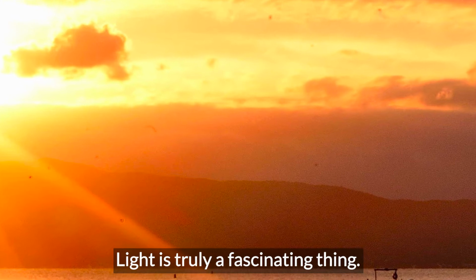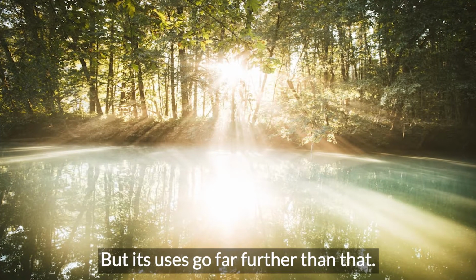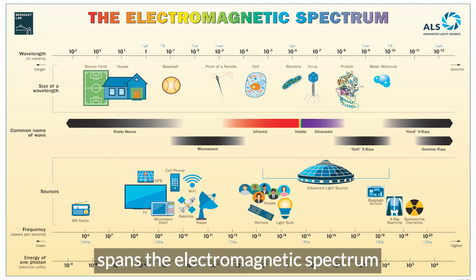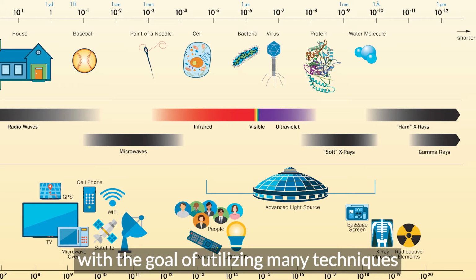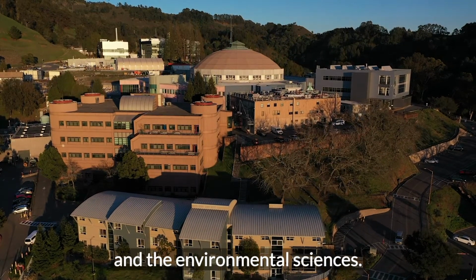Light is truly a fascinating thing. It allows us to see and illuminates the world around us, but its uses go far further than that. The light produced here at Lawrence Berkeley National Labs ALS spans the electromagnetic spectrum from infrared to X-rays, with the goal of utilizing many techniques that harness this light for research in biology, chemistry, physics, and the environmental sciences.